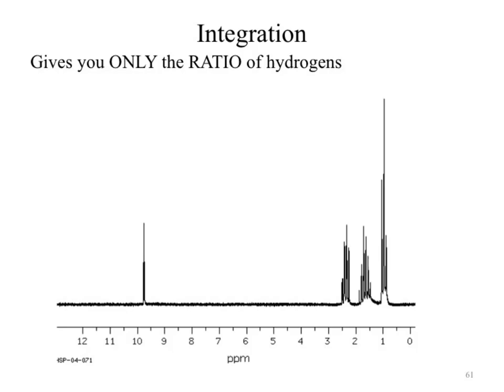Integration. How big is the individual signal? Look at that. Segued and everything. Okay. The integration gives you information about how much or how many hydrogens appeared in that individual signal. Okay. How is this going to affect our signal? Well, if we just look at a counter, okay, I got hit, I got hit, I got hit. We start counting those positions, right? And we could look at a taller peak. Okay, just like we did with mass spec.